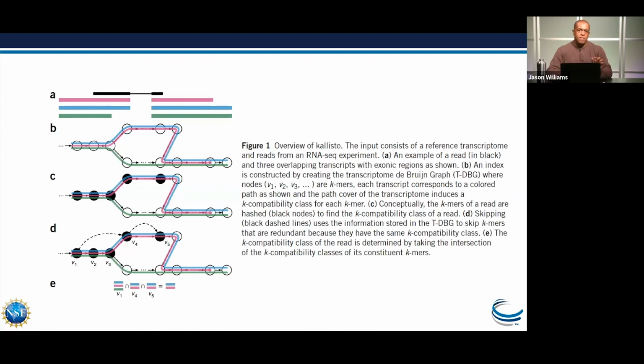One of the key insights of this thing called pseudo-alignment is that actually, when we're doing an RNA-Seq experiment, what we really care about is getting a count. How many times does a particular RNA transcript appear in our sample? And the conceptual idea is that if we look at sample A and sample B and count the transcripts and there's a difference, and that difference is significant, well, that may give us some biological insight.